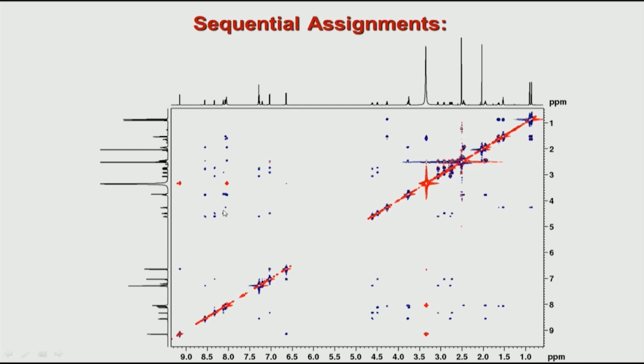and we have seen this in the last class where we looked at an example of alanine and leucine, where we saw that in ROESY you not only see the spin system of TOCSY for a given amide. Suppose I draw a line here for a given amide, I see not only the cross peaks from TOCSY, but I would also see additional peak from the previous, that is sequential I minus 1 amino acid.